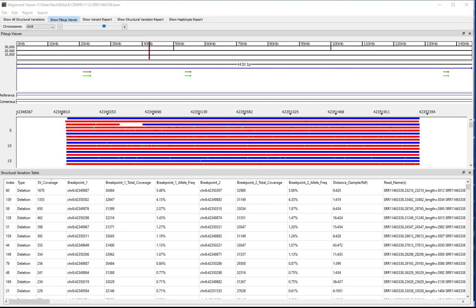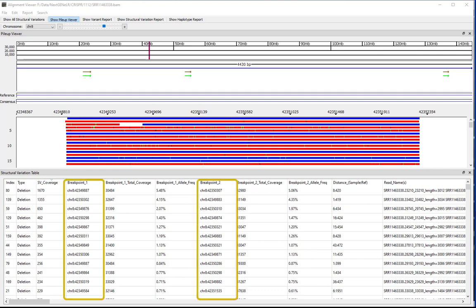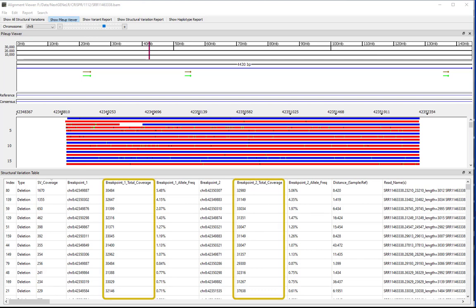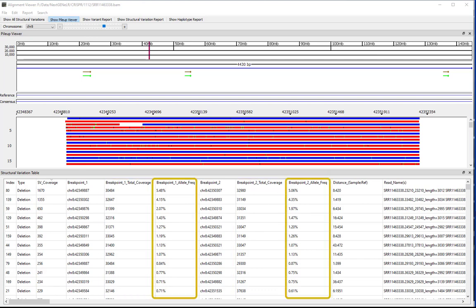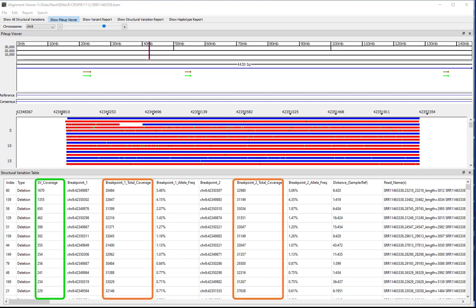The structural variation report is designed for detection of variants greater than 50 base pairs in size. Information shown in the report for each variant includes the variant type, the number of reads found to contain the structural variant, the chromosome coordinates for each breakpoint, the total coverage at each breakpoint, and the allele frequency at each breakpoint. The allele frequency is determined based on the SV coverage divided by the total coverage for the breakpoint.